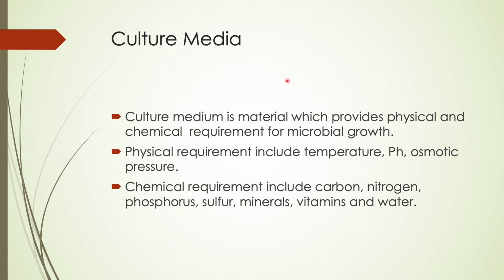So first of all, let's start with the culture media. Actually, before starting the introduction about what the culture media is, the culture media was first developed by Louis Pasteur in 1860, because he was the first to use culture media for growing bacteria in the laboratory.